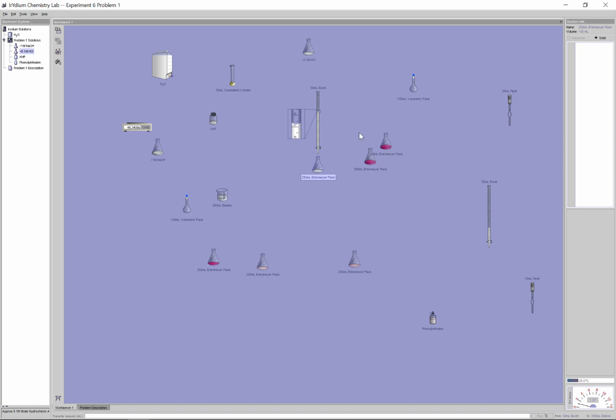I'm really hoping I have enough for this part because even if you follow the same recipe, I had made the diluted amount here. You just took 8 milliliters and add 100. Every time you try to pour in 8, every time you try to line it up with the 100 mark here, there's no guarantee the concentration is exact. The titration here, the goal is to be really, really precise. So let's just hope here. This one might not work.